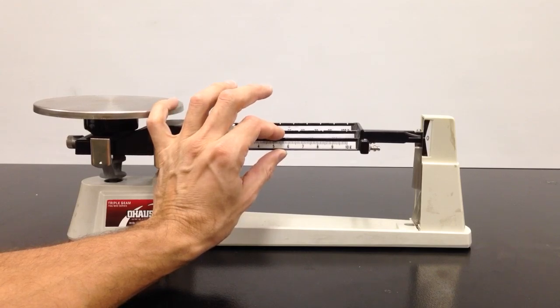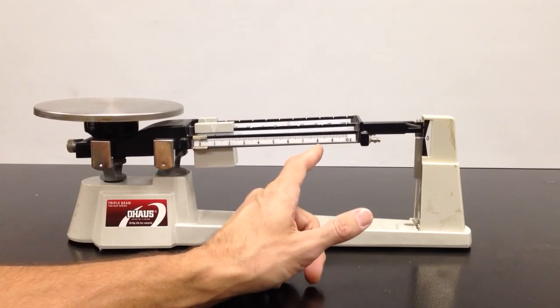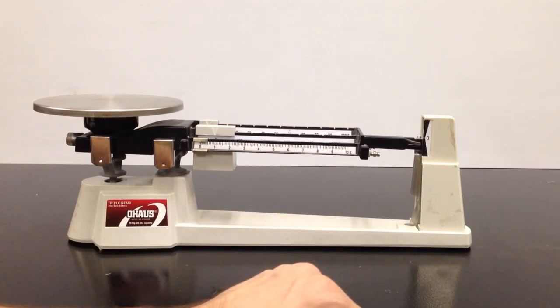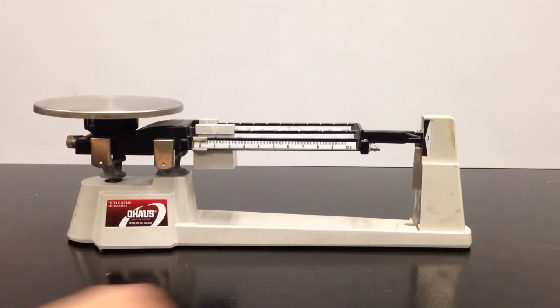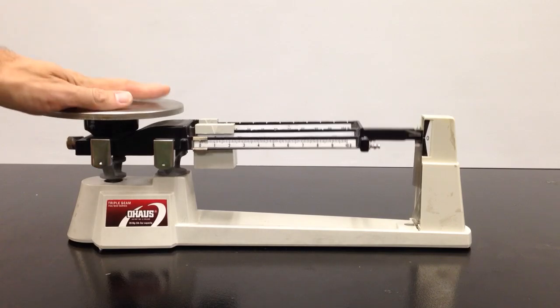When things are too light, the balance will point up. When things are too heavy, the balance will point down. And here's the base. That's about it for the parts of a triple beam balance.